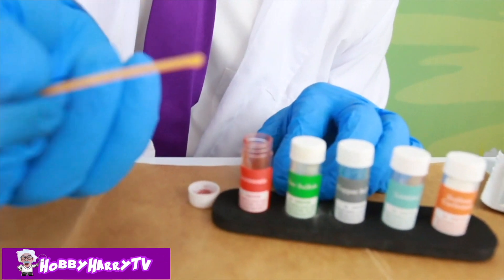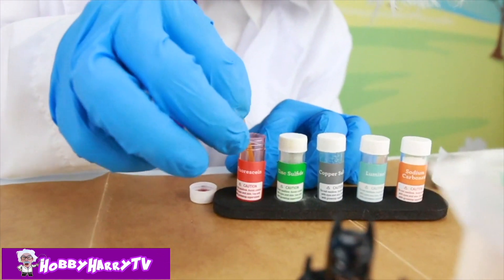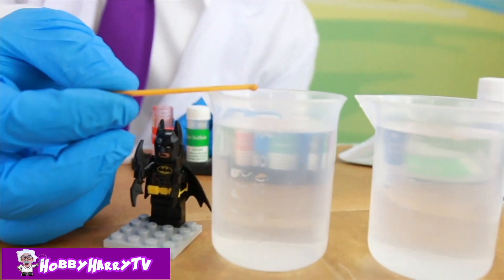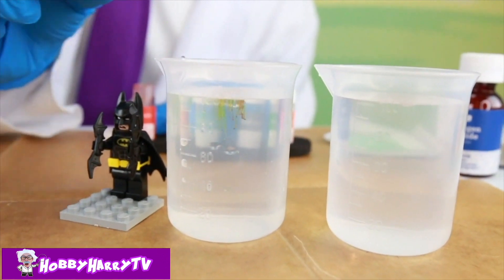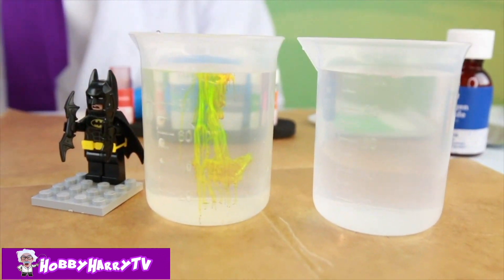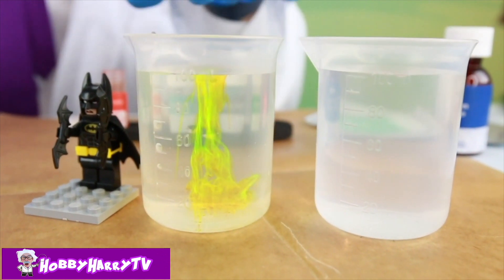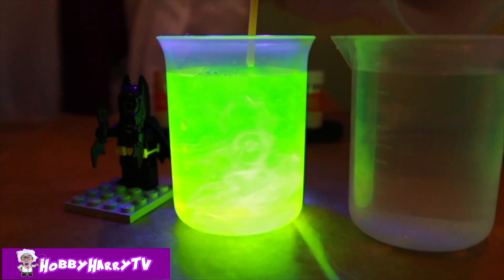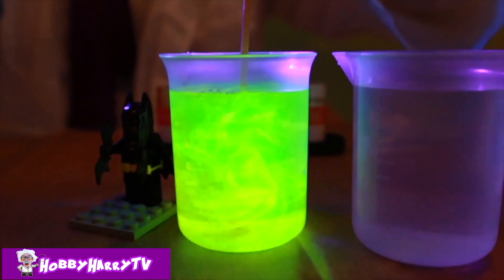We're going to grab a very small scoop of our fluorescence here. That's a very small amount! Now we're going to dump that into our 100 milliliters of water! Whoa, that's cool! It's red here and now it's turning yellow here! See it? Looks like nothing's happening! That is so cool! Can you see it now guys? That's really cool!